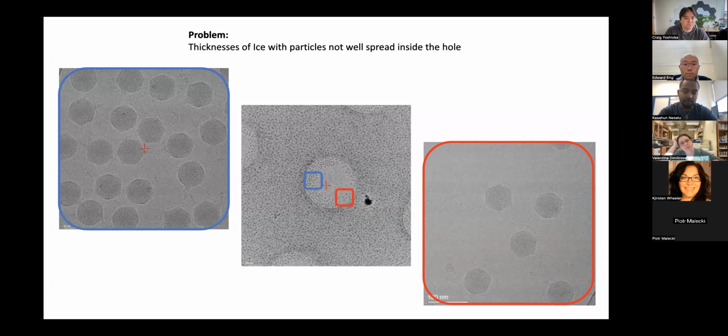So at the left, we have a very good amount of particles in the images, and on the right, we have fewer and sometimes no particles. So then we need to use other strategies that increase the number of shots per hole. But yeah, it's a kind of thing that I like to show.